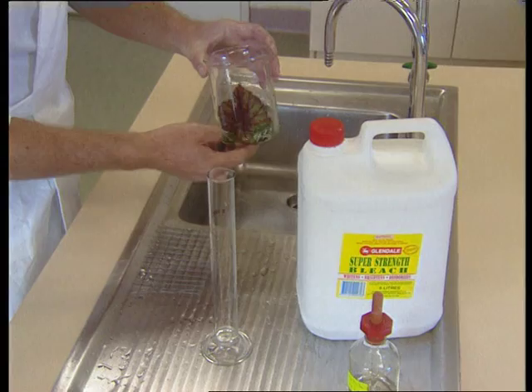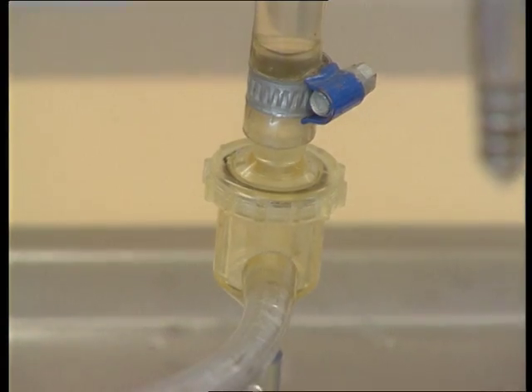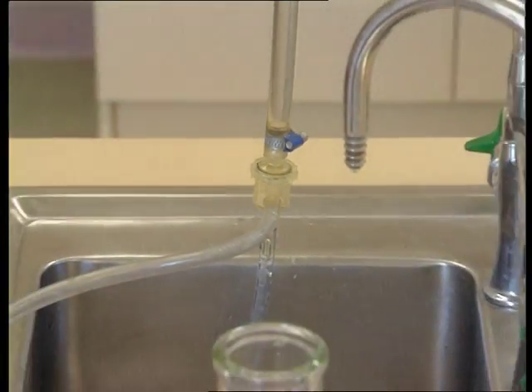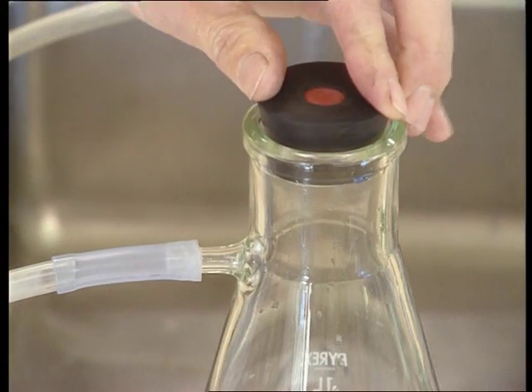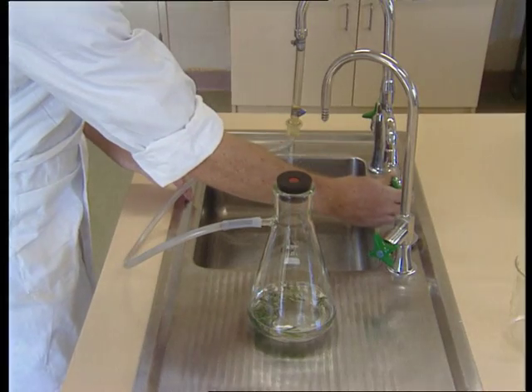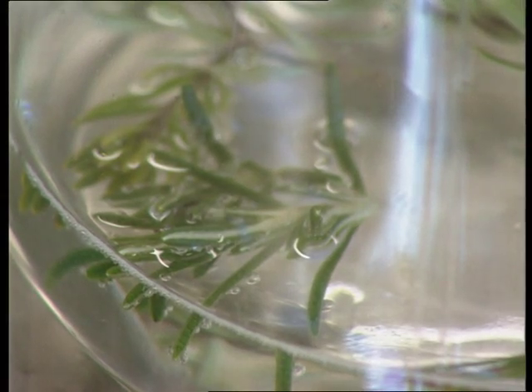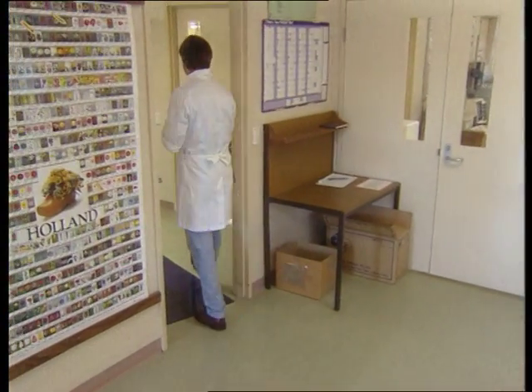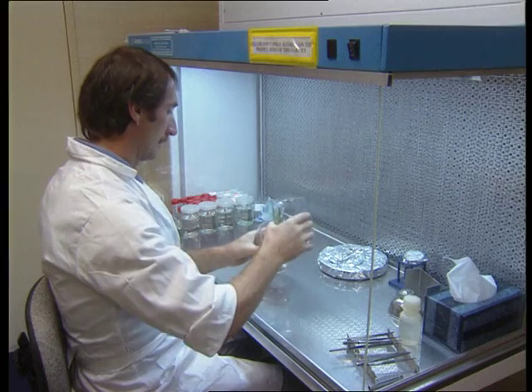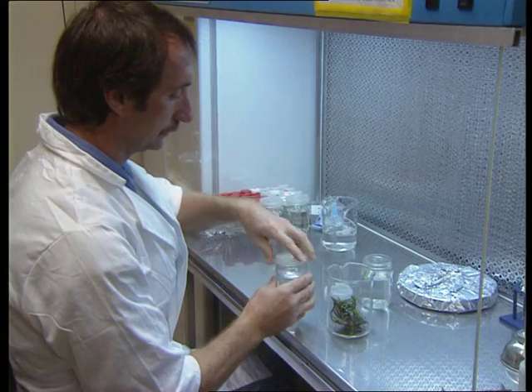Modifications to this basic procedure that can be used to improve efficiency include mechanical agitation and use of vacuum, as demonstrated here. Finally, everything is taken into the laminar flow cabinet, the hypochlorite solution is discarded, and the plant material is rinsed 2 to 3 times in sterile distilled water.